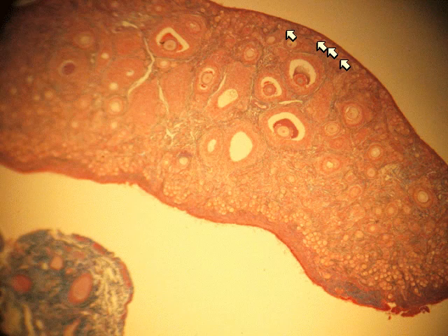Now, what you're noticing deeper in this particular slide in the ovary, you see some follicles that are in various stages of maturation. Let's see. This one, I guess it looks like it's probably one of the most mature of these. And right in the middle of that blue circle where I've got an arrow pointing, that's the cell that for lab you could call the ovum, but technically from your lecture you'll know that that is the secondary oocyte. And that's the cell that's going to rupture from the surface of the ovary during ovulation.